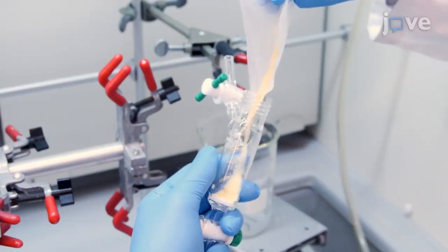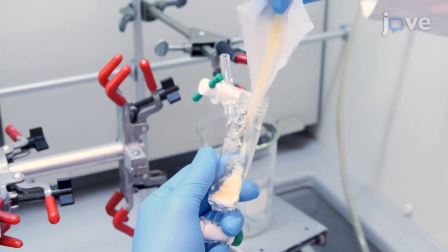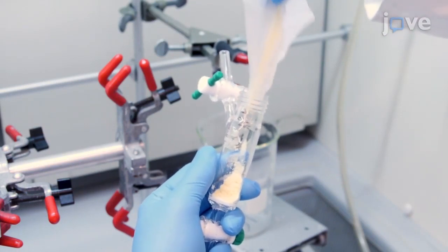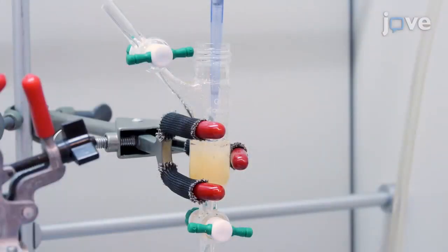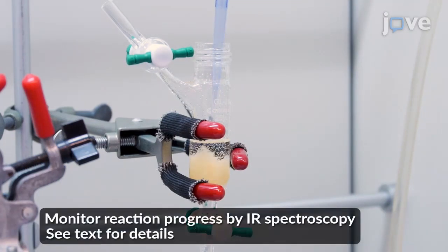To begin the synthesis, add to a 25 milliliter solid-phase reaction vessel 1 gram of REM resin, 20 milliliters of dimethylformamide, and 2.4 milliliters of furfurylamine.